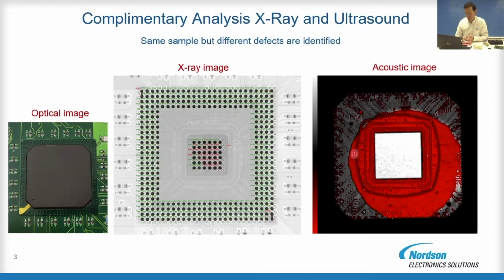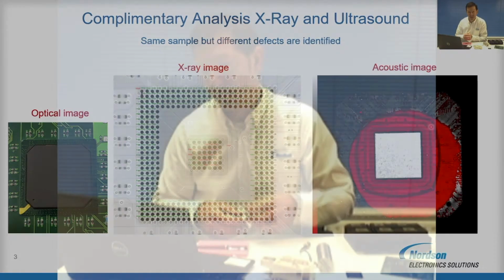In this case, we've added red to the delamination or voiding, and this void is at the mold compound to substrate interface. Substrate being the substrate of the BGA. Just going around it with the highlighter now. So between the black mold compound and the substrate level. So that delamination probably goes right underneath the die, and it's an electrical failure, and it's probably been caused by overheating, either from soldering, or it's been powered up and it's popped.